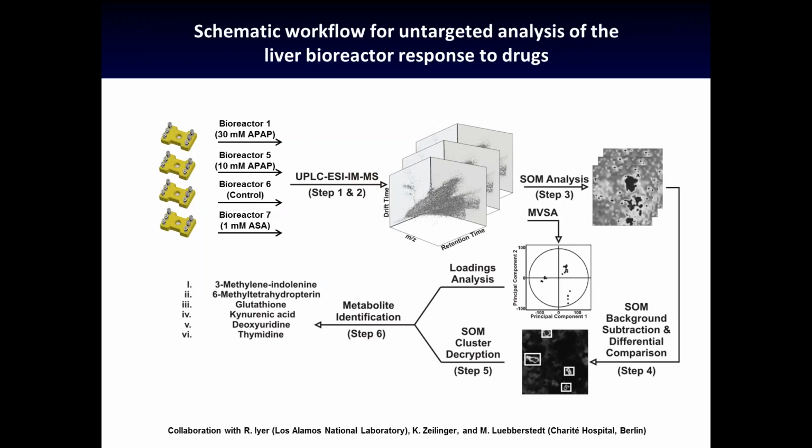In this particular case, we're probing the toxicology of the acetaminophen exposure, or APAP. Now, ASA is acetyl salicylic acid. Salicylic acid has negative consequences on the kidneys, so in the liver context, we're using it as a negative control. And then with the kidney construct, we use APAP as a negative control. Oftentimes we're doing both static and dynamic measurements. Step 1 and 2 is collecting fractions from the waste channel and collecting the broad scale metabolomics data, and then the 2 roads divide.